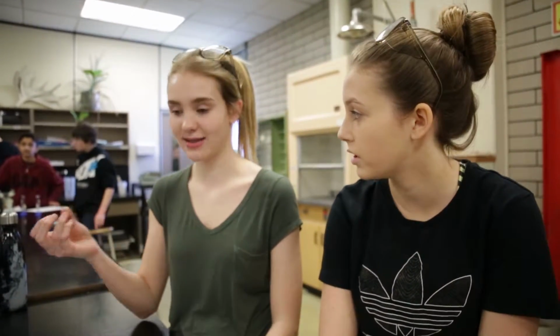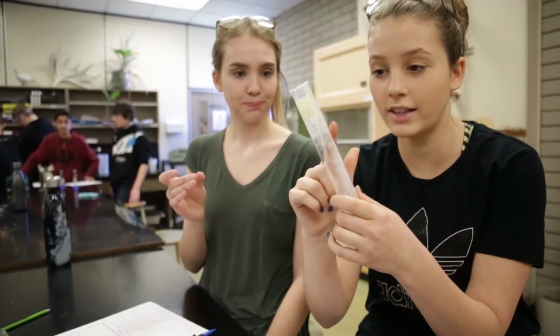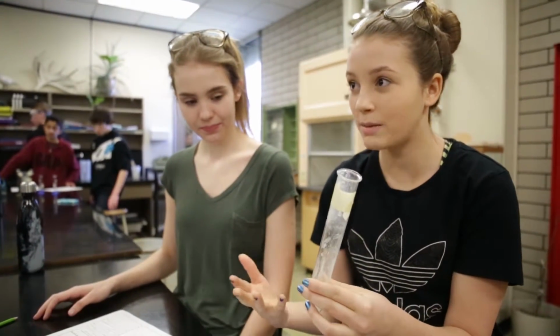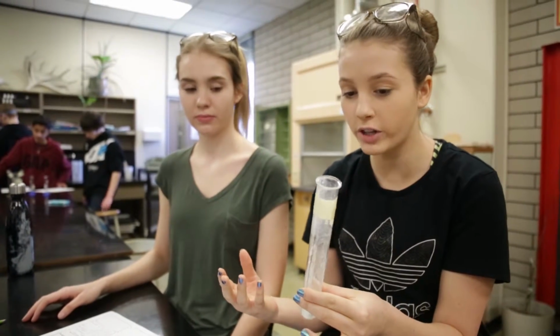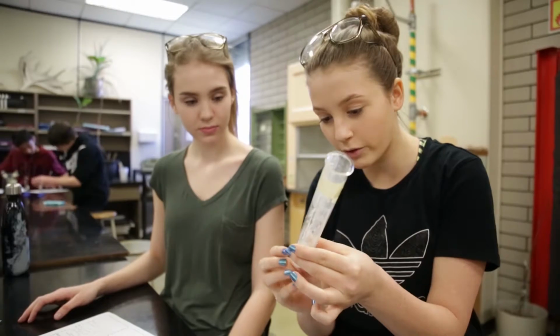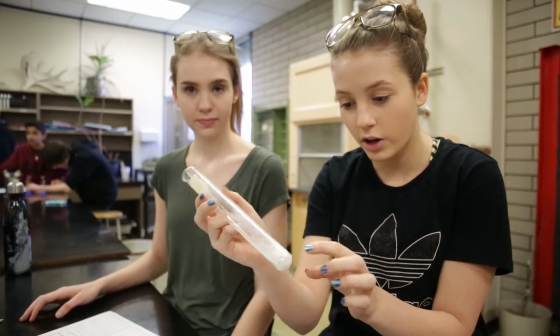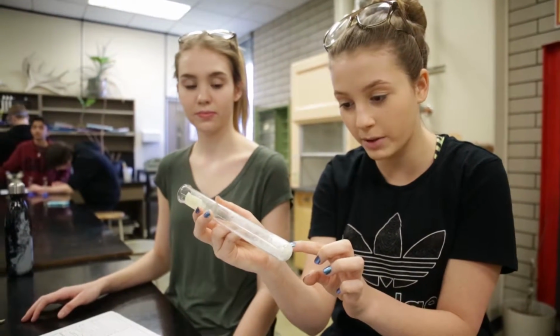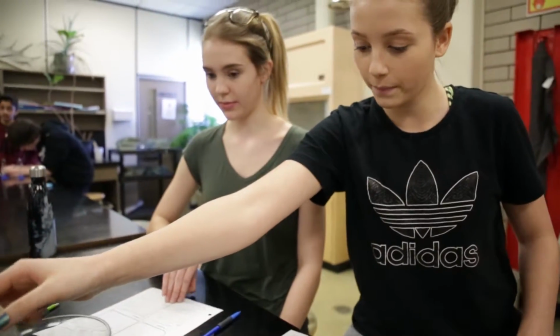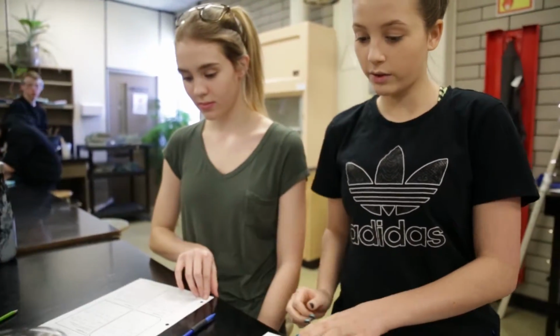And then as it started to evaporate more, it started to leave a kind of salty residue on the side of the beaker, like it's cloudy. And then when the last little bit was boiling, it smelled salty, like the ocean, which could be baking soda, but we really think it's salt. And at the bottom, if you look in, there's little crystals in there that could be salt. So that's what makes us think that, because something was left over. And so that's what we think.